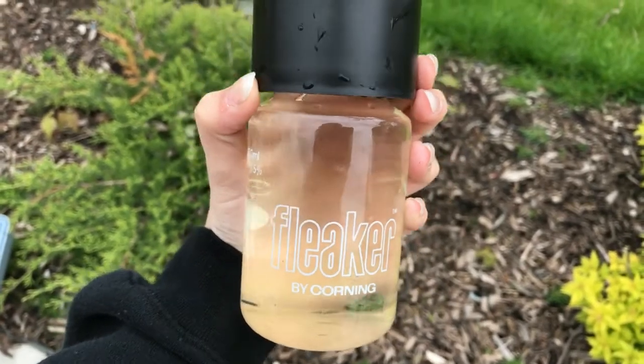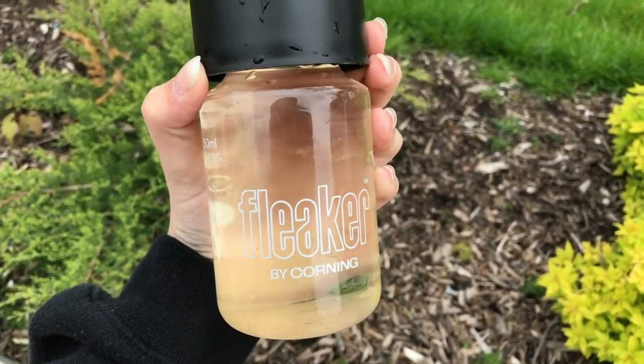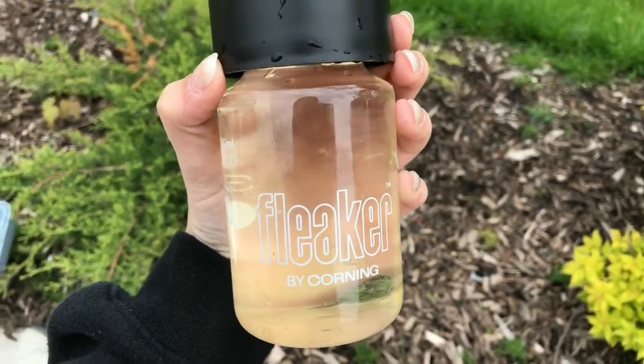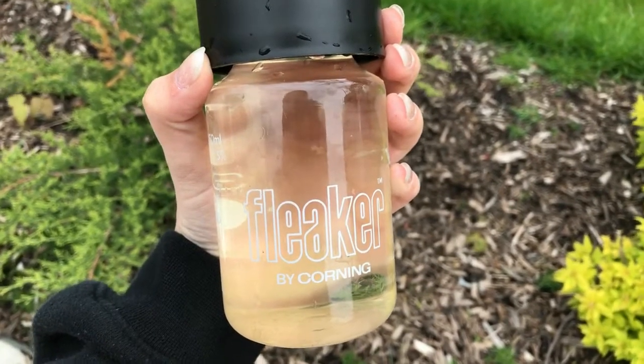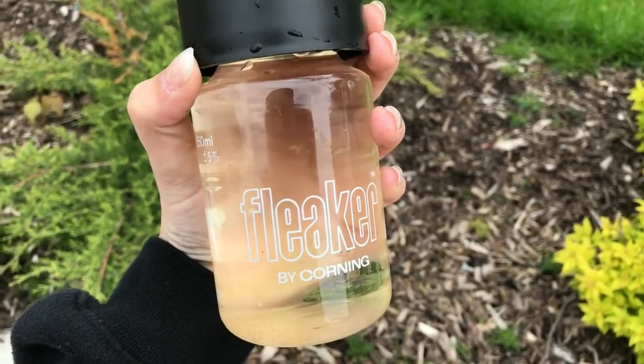This is a five-day test. For the fleeker you're going to want to store it in a dark place at room temperature. After we do our dissolved oxygen test, we will wrap this fleeker in foil, store it for five days, and then come back to it.